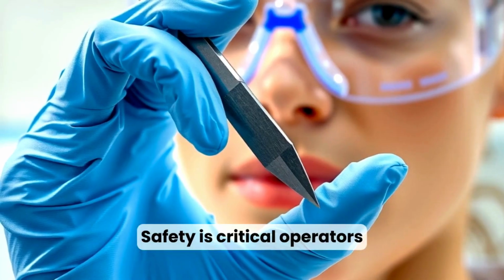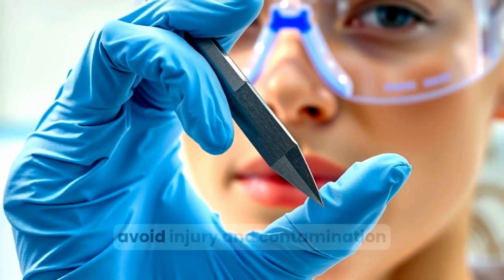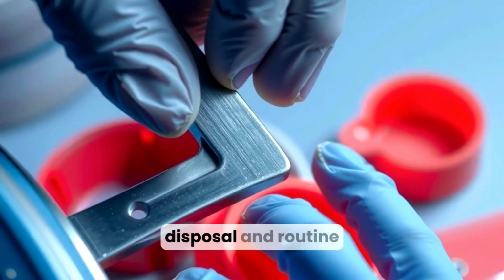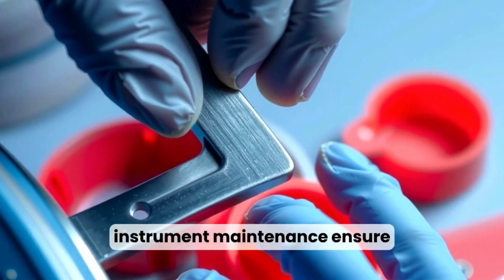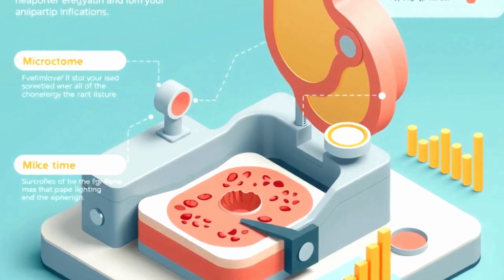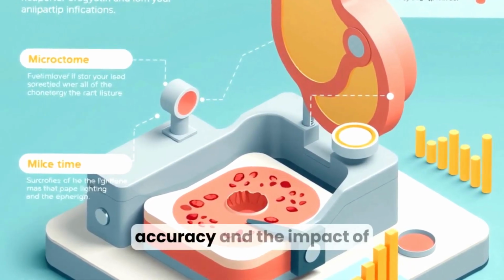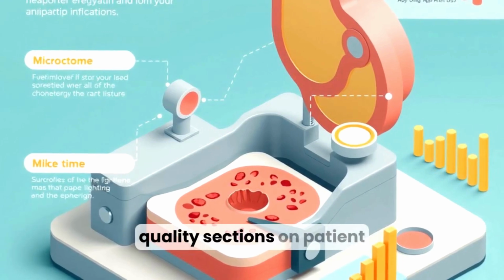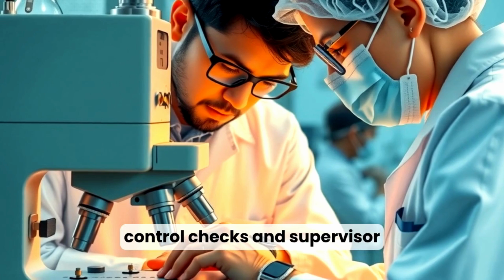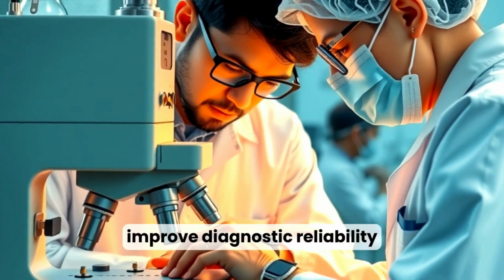Safety is critical. Operators must wear cut-resistant gloves, eye protection, and follow blade handling protocols to avoid injury and contamination. Regular blade changes, proper disposal, and routine instrument maintenance ensure consistent performance and reduce the risk of specimen damage. Callouts highlighting clinical importance can emphasize turnaround time, diagnostic accuracy, and the impact of quality sections on patient outcomes. Consistent training, quality control checks, and supervisor reviews help maintain sectioning standards and improve diagnostic reliability.